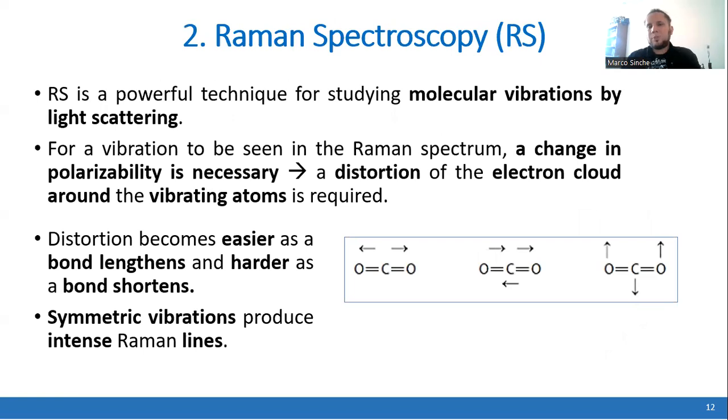Regarding Raman spectroscopy, this is a very powerful technique that is focused on the study of molecular vibrations provoked by light scattering.